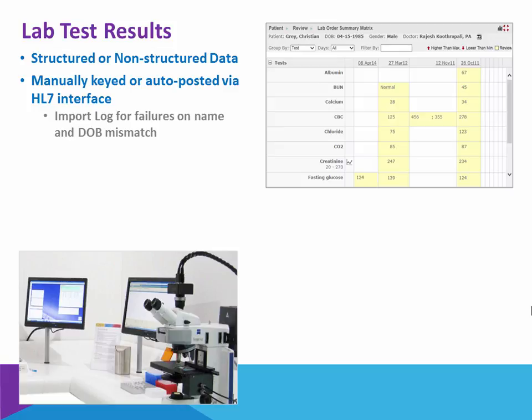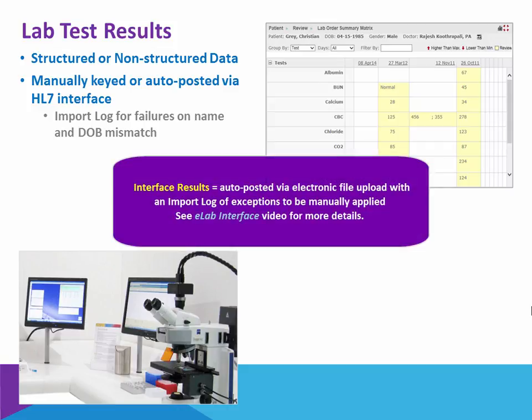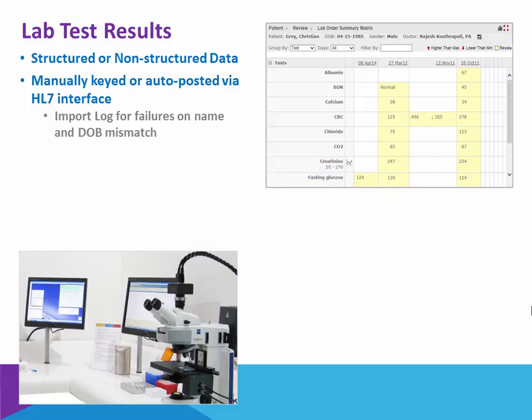Now, if you are using the interface, there is an import log that catches failures that can then be manually corrected so that no results are missed. That, of course, is covered in more detail in the eLab video. Lab results come in two flavors.